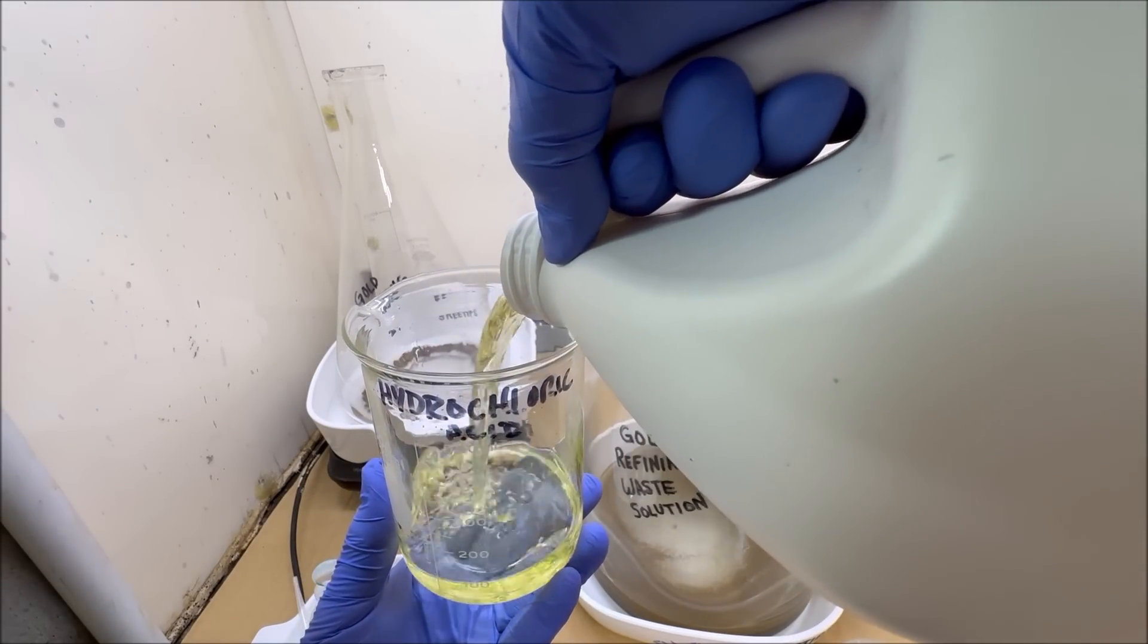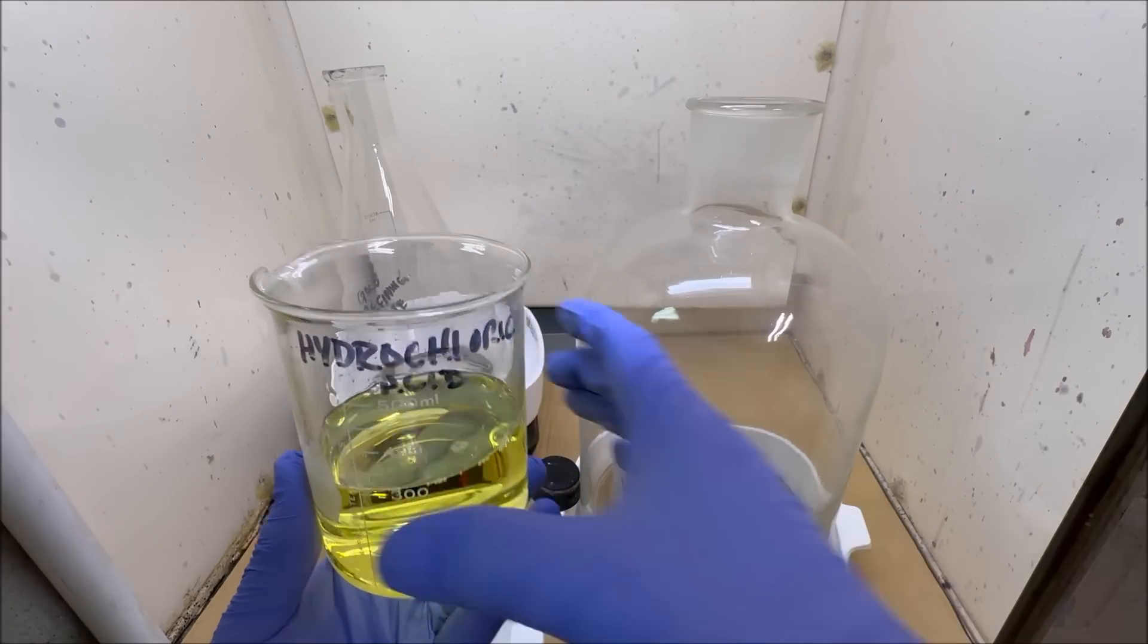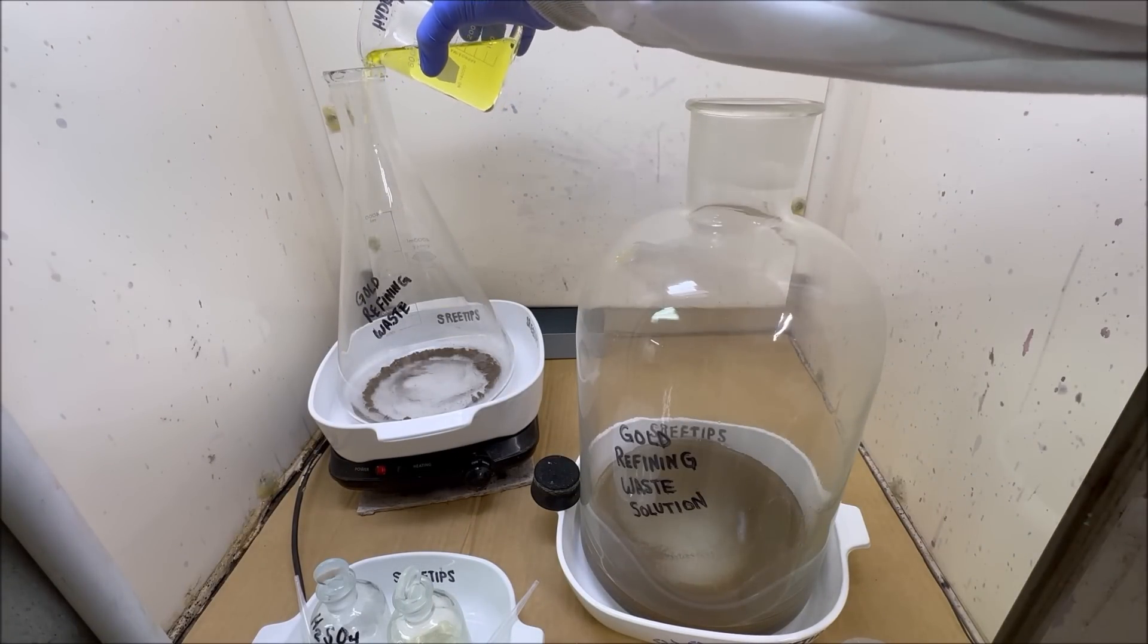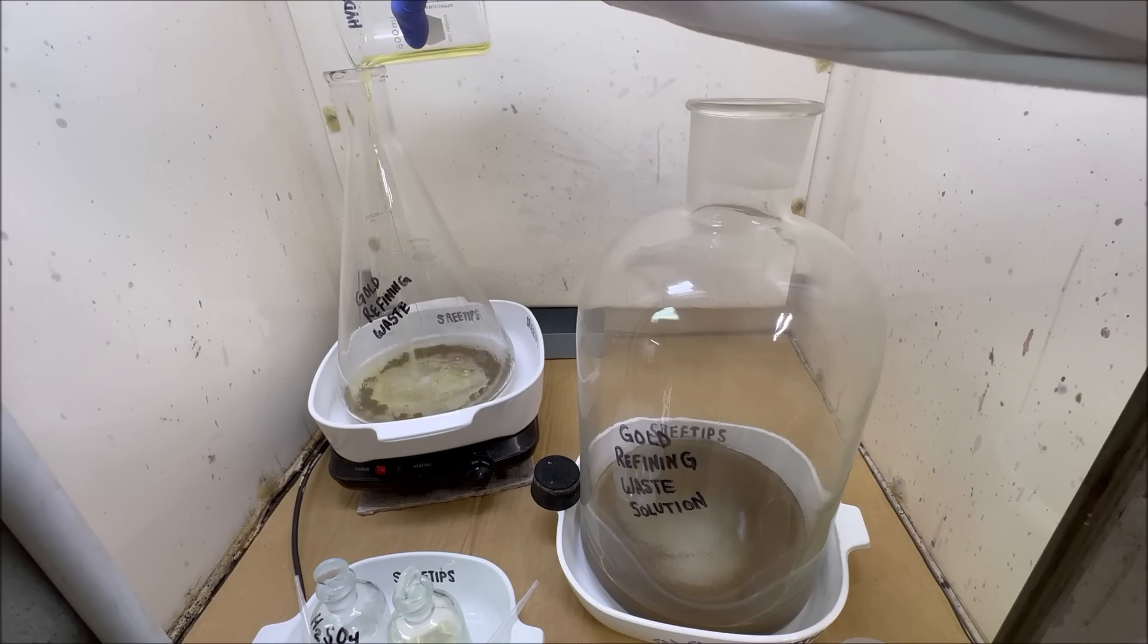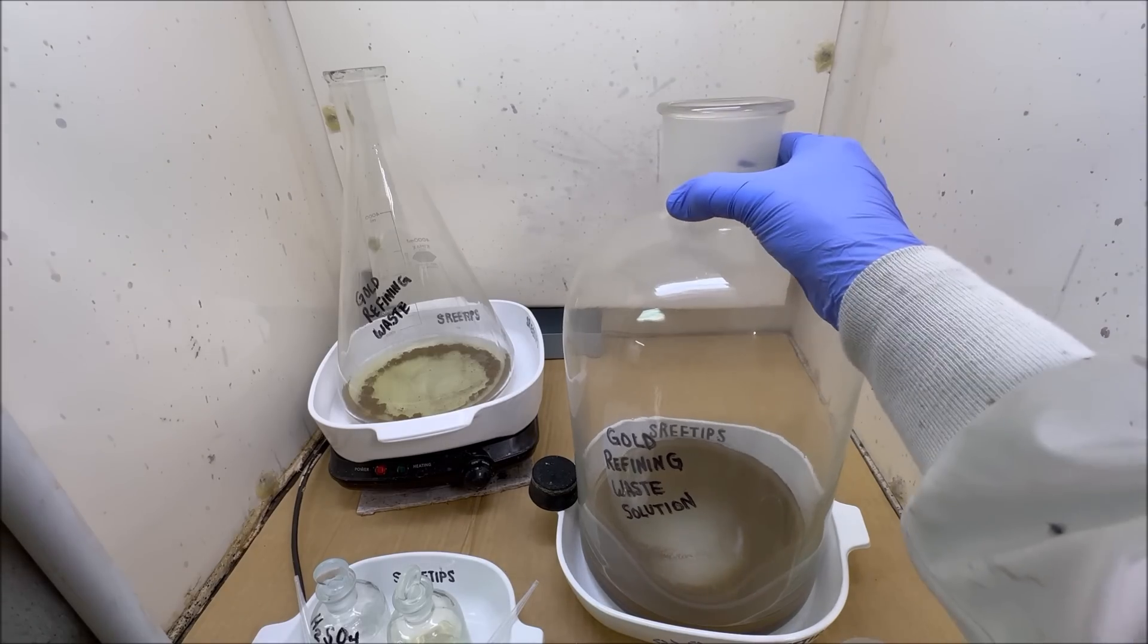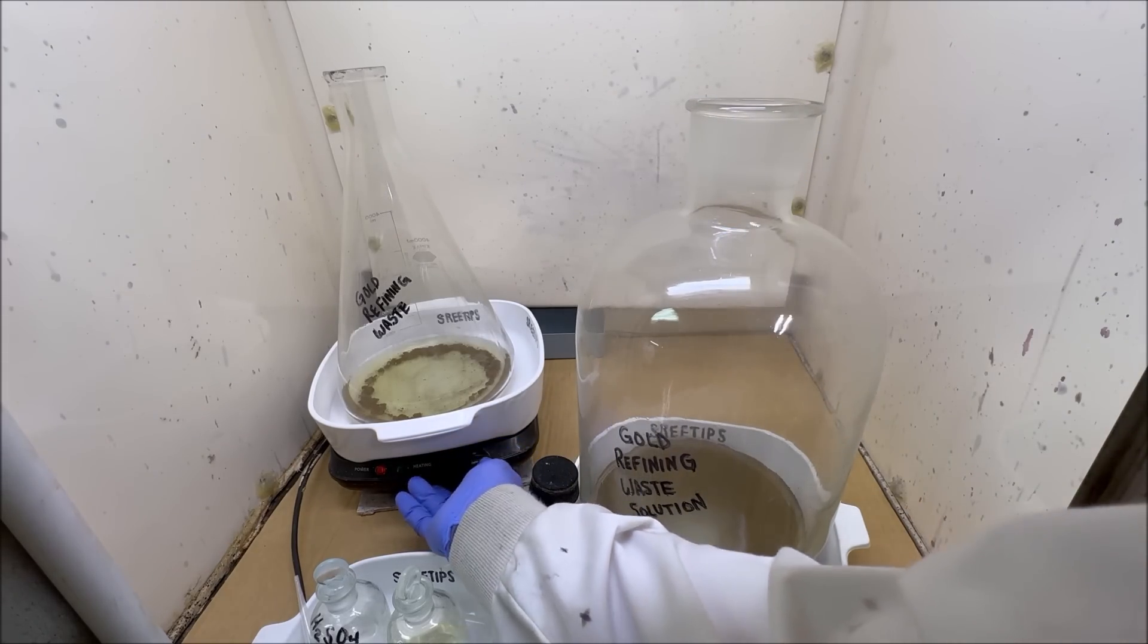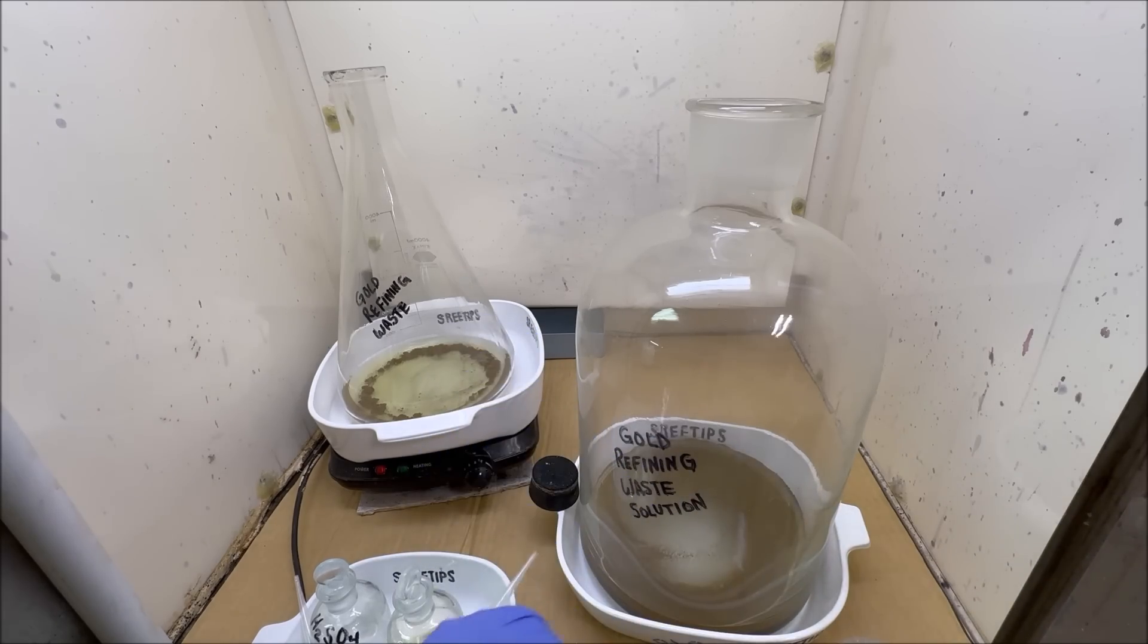What happens is a little bit of the gold gets poured off every time I do a rinse and it accumulates in these containers. Today we're going to try to recover the pure gold out of these waste containers. This container is not heat resistant glass, this one back here is, so I'll add a little bit of heat to this one in the back.